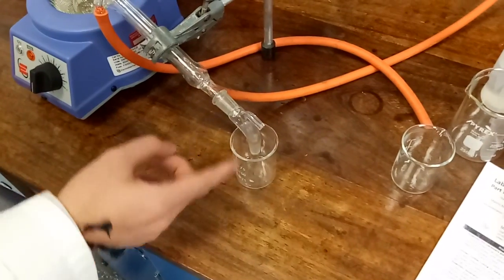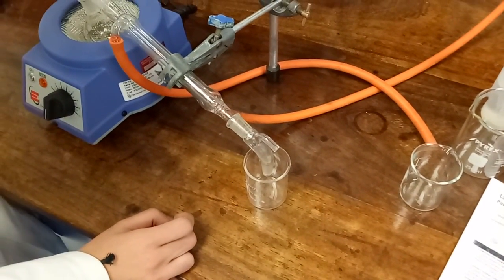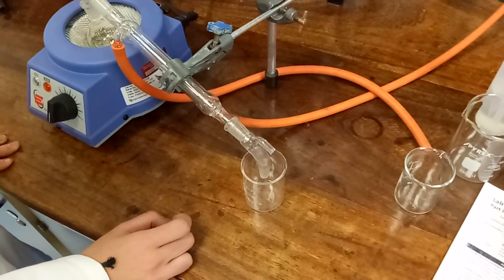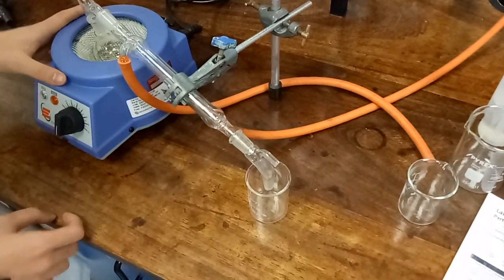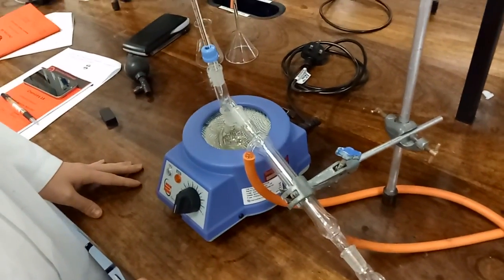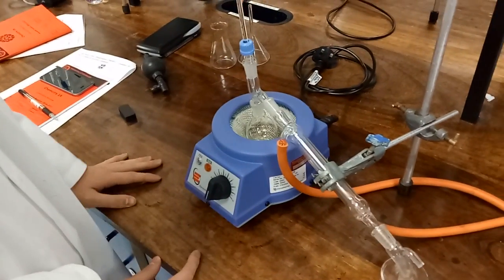You have a beaker to collect the liquid that comes from the condenser. This is the heating mantle, which allows you to boil your solution.